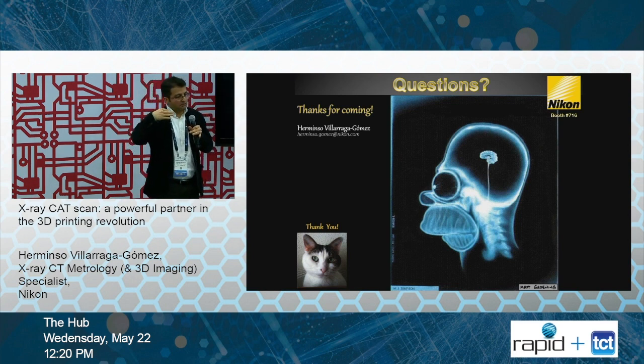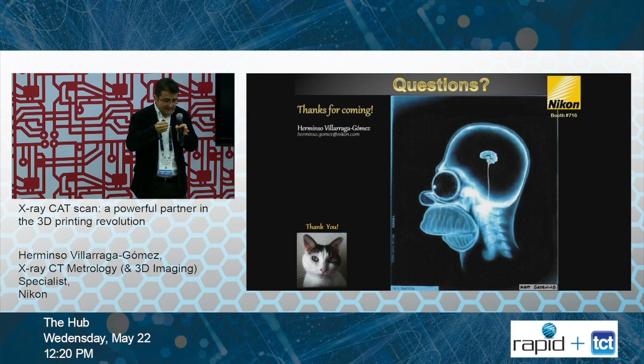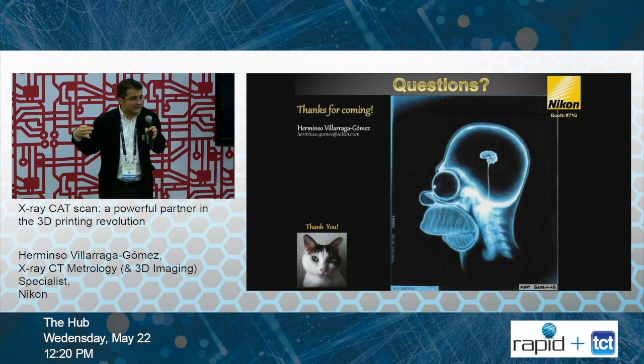it has an exponential decay when it passes through the part. So there are 2 things that limit the pass of the X-rays to the detector. One, the distance. As the distance in the sample increases, the X-ray intensity decreases. And the other thing is the material. If the material is plastic, no problem.